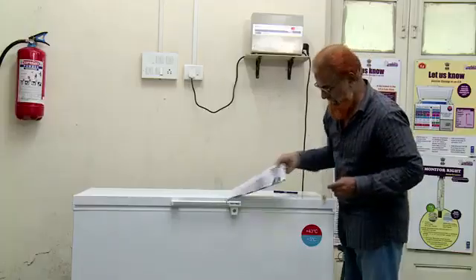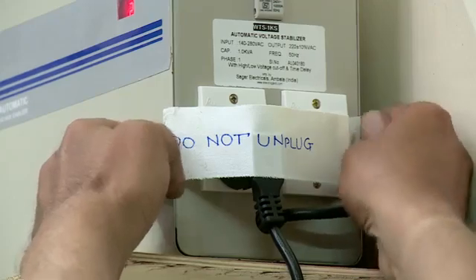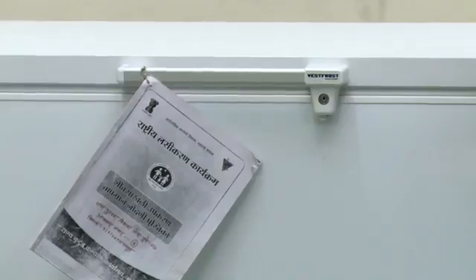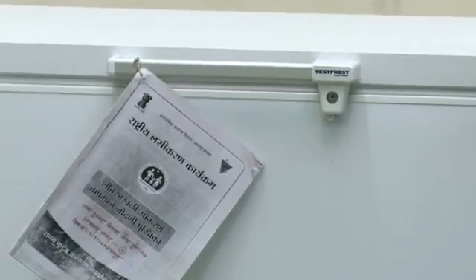The temperature chart should be updated and used regularly. A 'Do Not Unplug' sticker should be put on the power plug. This procedure should be carried out from time to time to ensure proper working of the equipment.